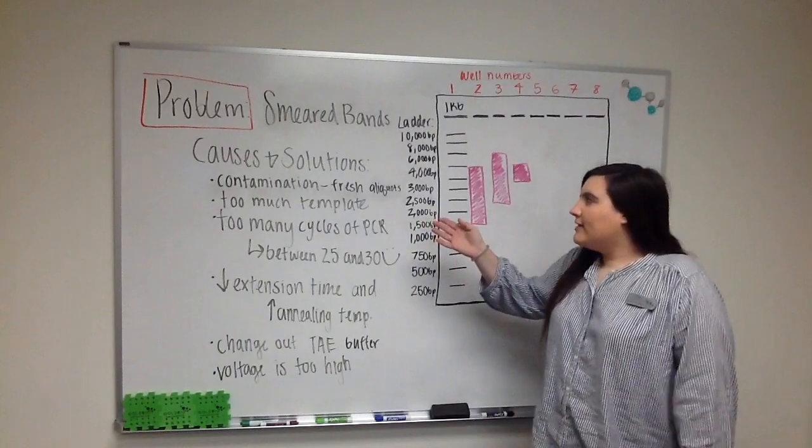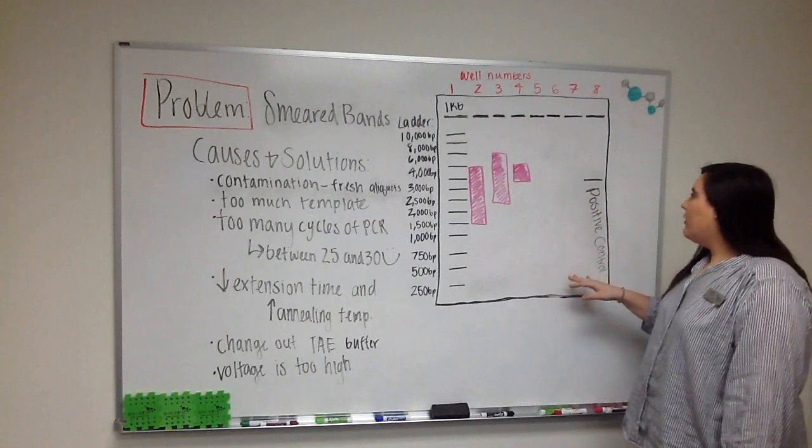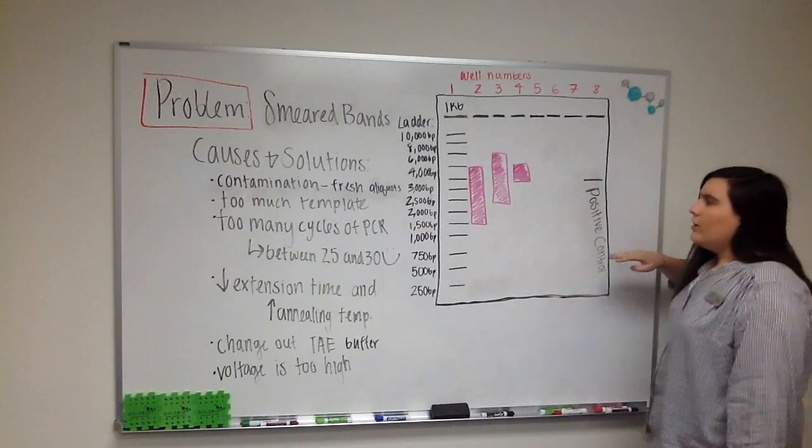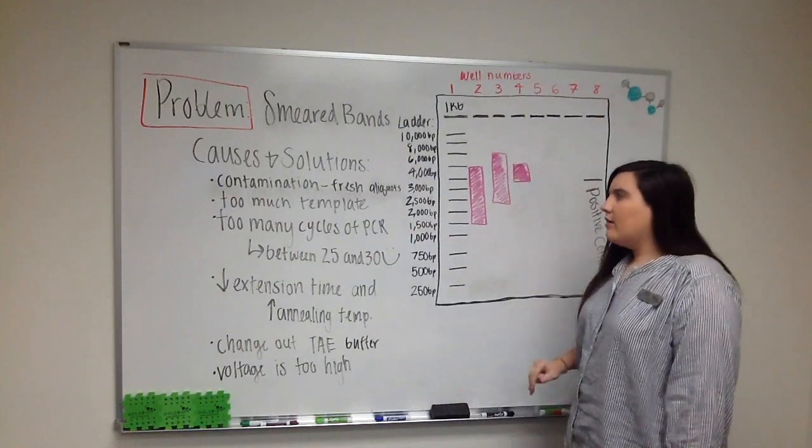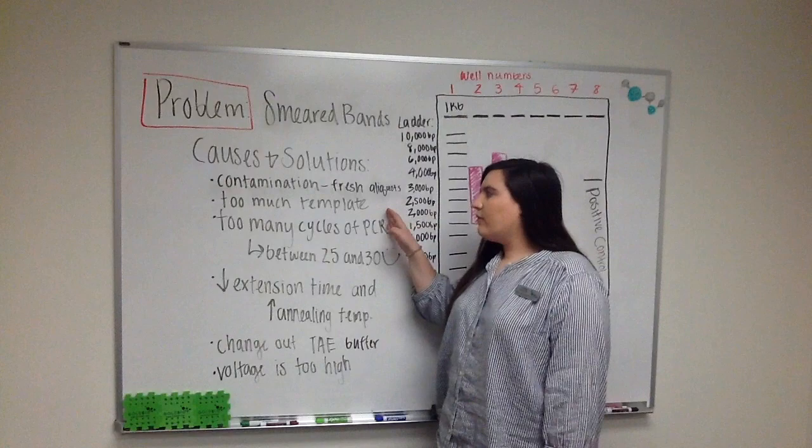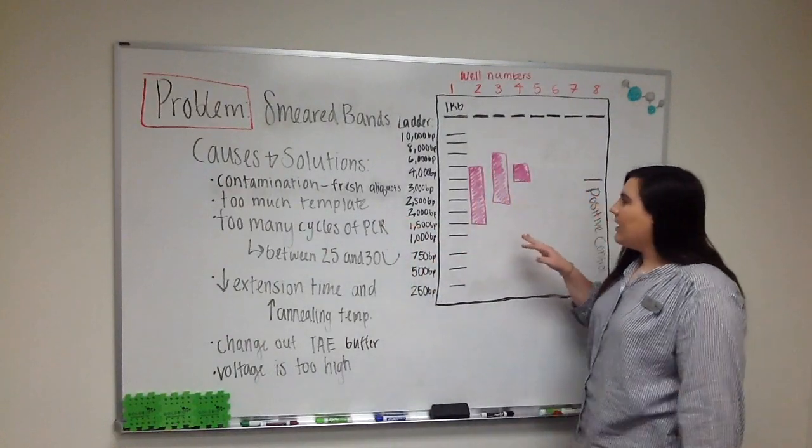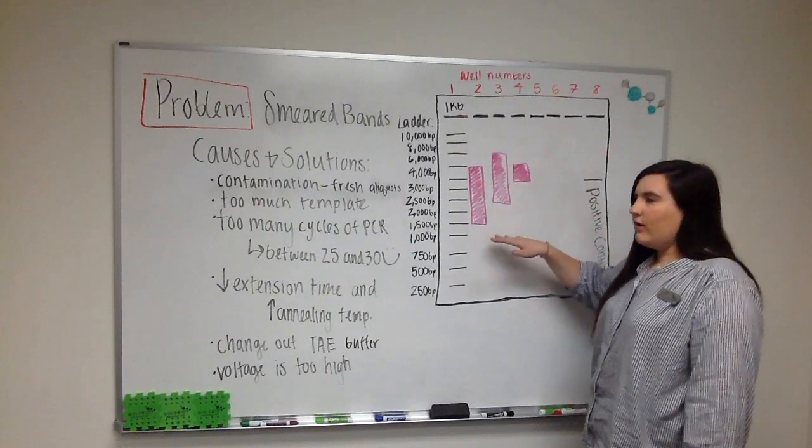The final problem we're going to be looking at today is smeared bands. How this might appear on the gel is instead of getting your nice tight band that you were looking for, you actually got some smearing down the gel during gel electrophoresis. Some common causes and solutions for this is that you might have had a contaminant that was degrading your DNA causing different length fragments which can look like this smearing effect down the gel.